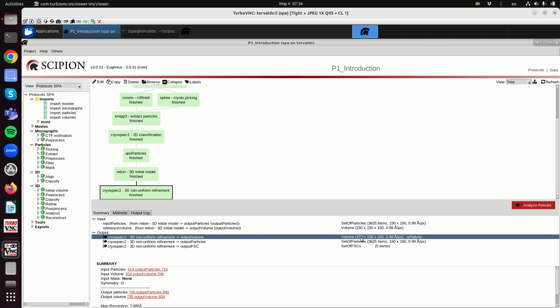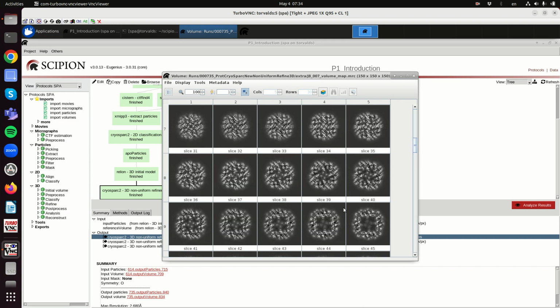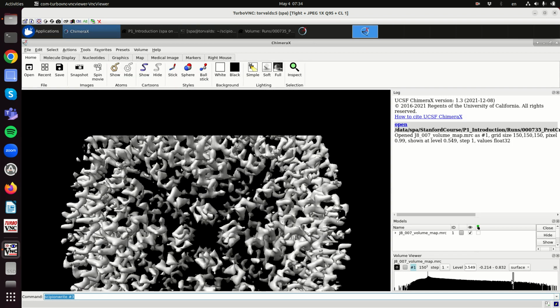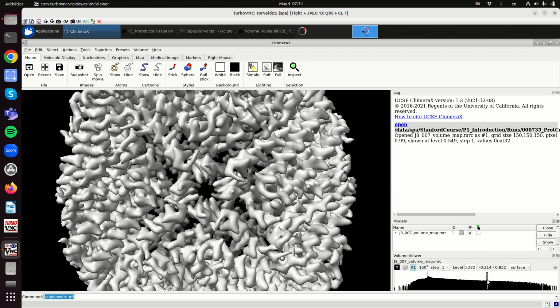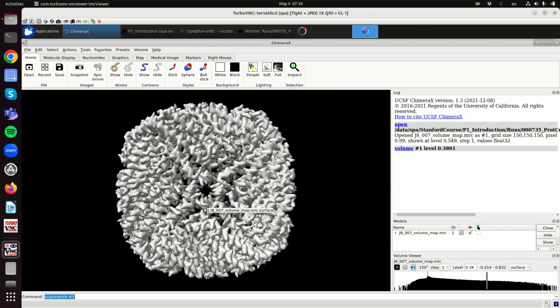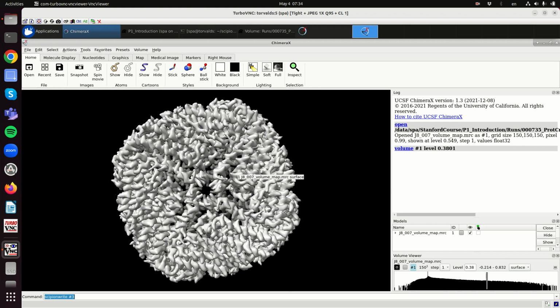And then here we have a pretty good structure. We can see it in 3D. It is generally important to have a look at both levels, 3D, but also at the level of slices, to see if we detect any pattern that shouldn't be there. And we see some nice stuff.